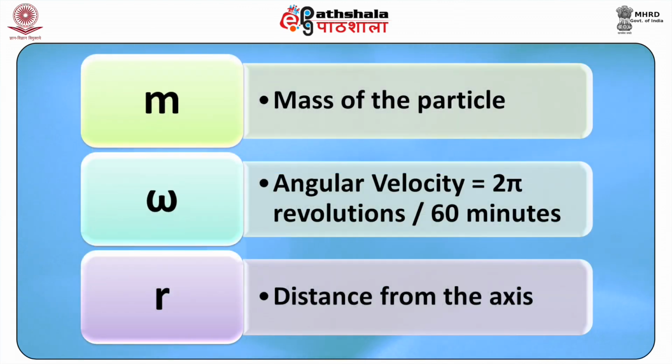The particle in a centrifugal field will experience a centrifugal force defined by the product of the mass of the particle, the distance from the axis, and the square of the angular velocity.